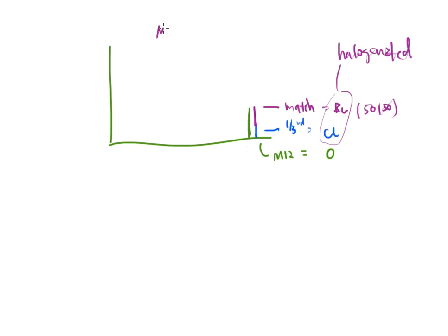And that's really what our concern is about, M+1 and M+2. We said that with the M+1 peak, we can do a calculation that will allow us to determine the number of carbons, as long as we're talking about a hydrocarbon. And we said that an M+2 peak, those typically come from oxygen or bromine or chlorine, and depending upon the height of that M+2 peak, we'll be able to determine if things are present or not.